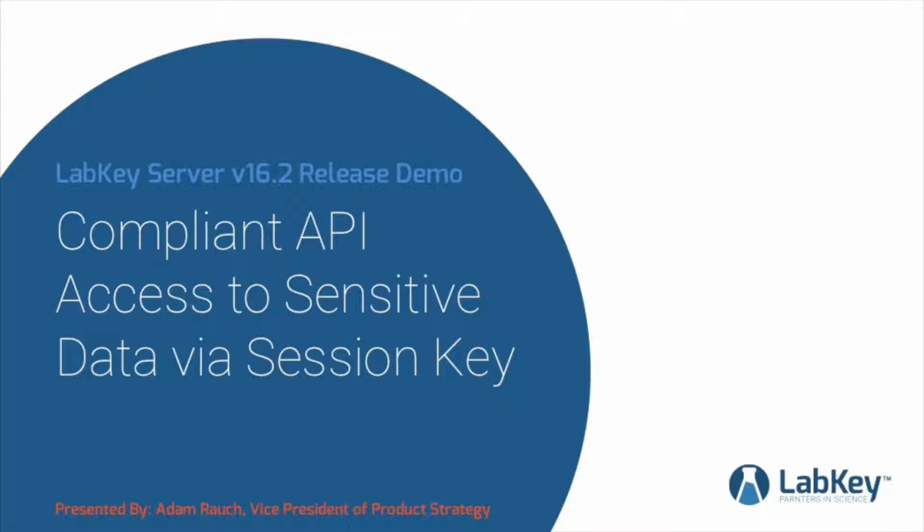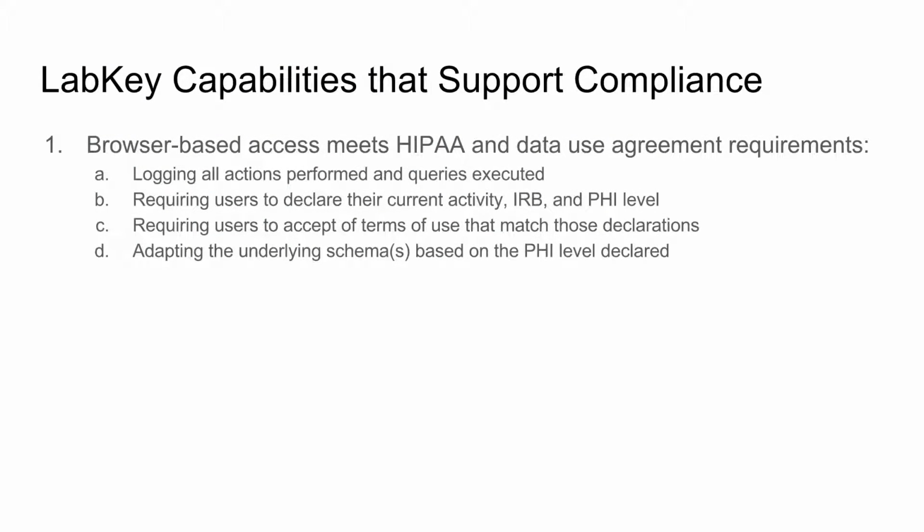This is a demo of API session keys, a new capability of LabKey that we added to support regulatory compliant access to sensitive data using application programming interfaces. LabKey has many capabilities to support regulatory compliance and compliance with data use agreements that might have been signed with partners. Our focus has been browser-based access to this type of data. So typically patient data that must be accessed under these regulatory frameworks.